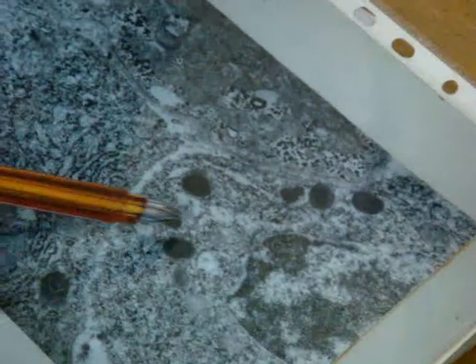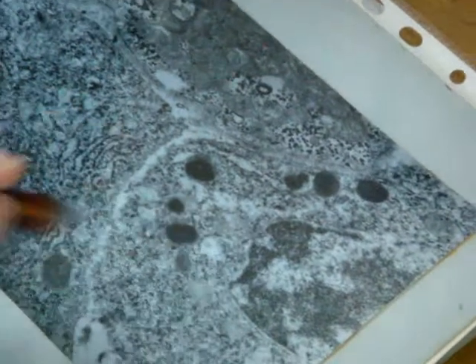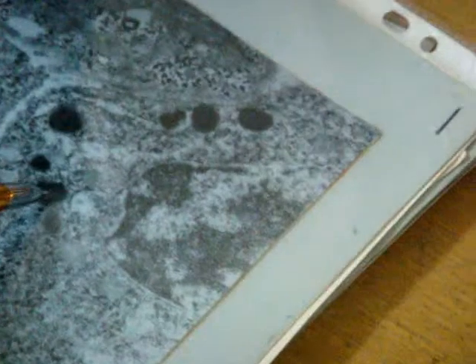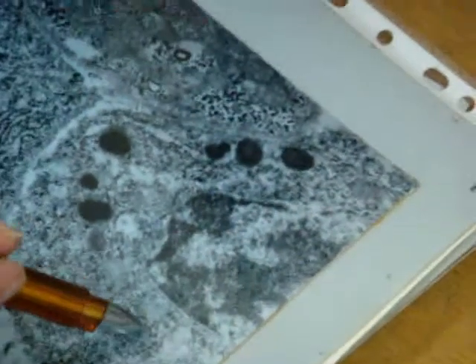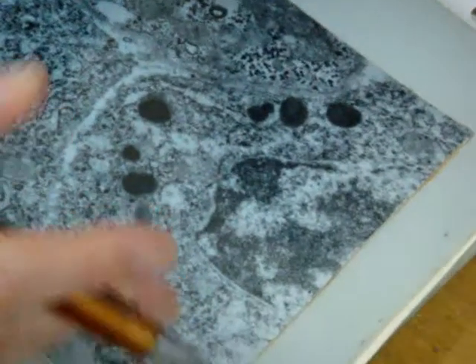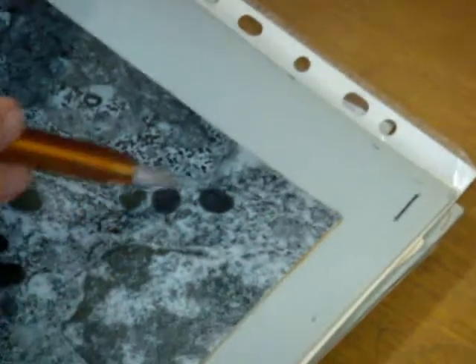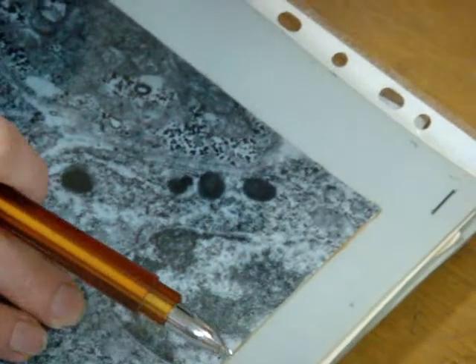There we can see maybe secretory granules or lysosomes. Sometimes it's unclear. Let's look at other organelles. If these are secretory granules, we should find rough endoplasmic reticulum. Rough endoplasmic reticulum is absent, yes, we can see only free ribosomes, so the cell produces protein for itself, maybe for the primary lysosome. So these are probably secondary lysosomes. So this is a macrophage.